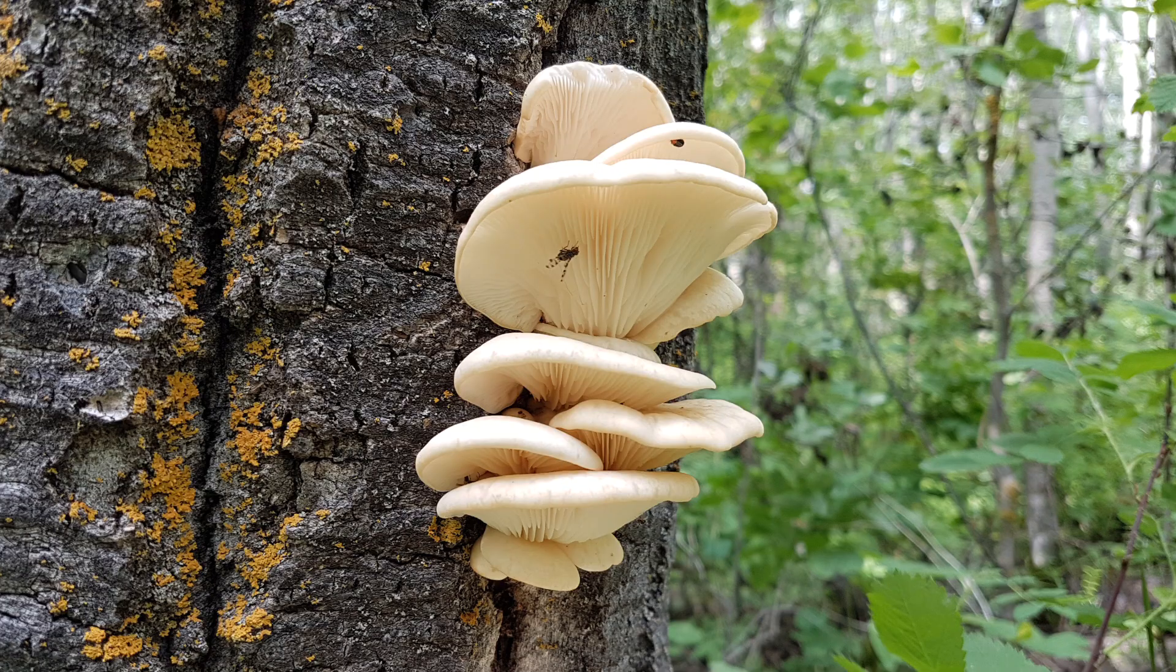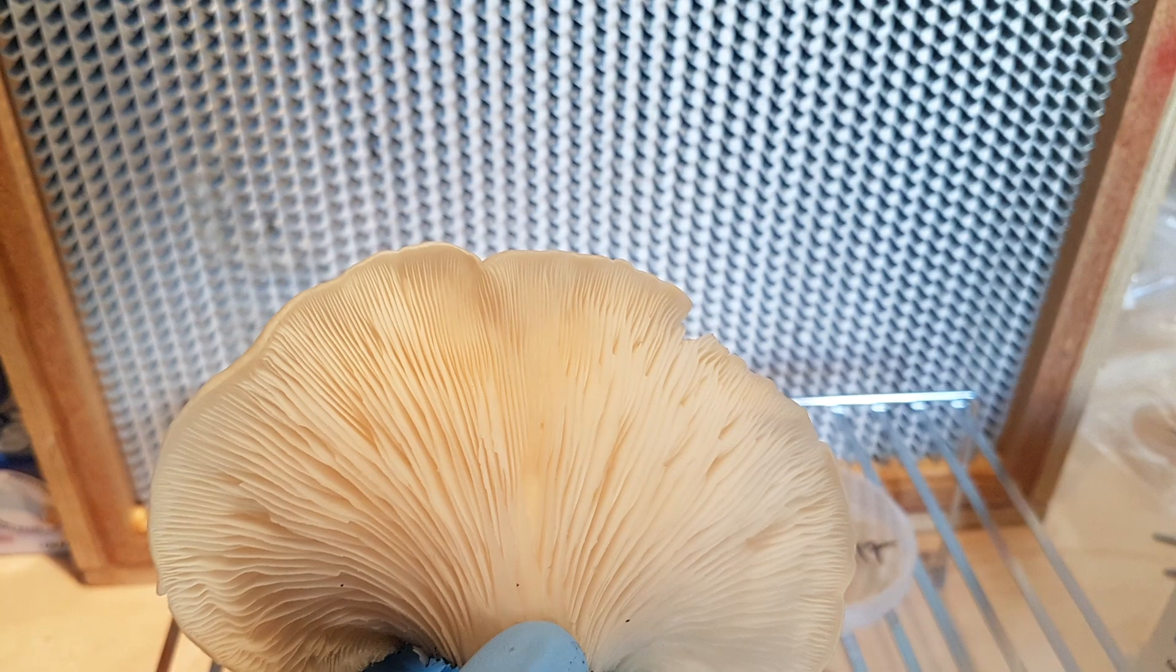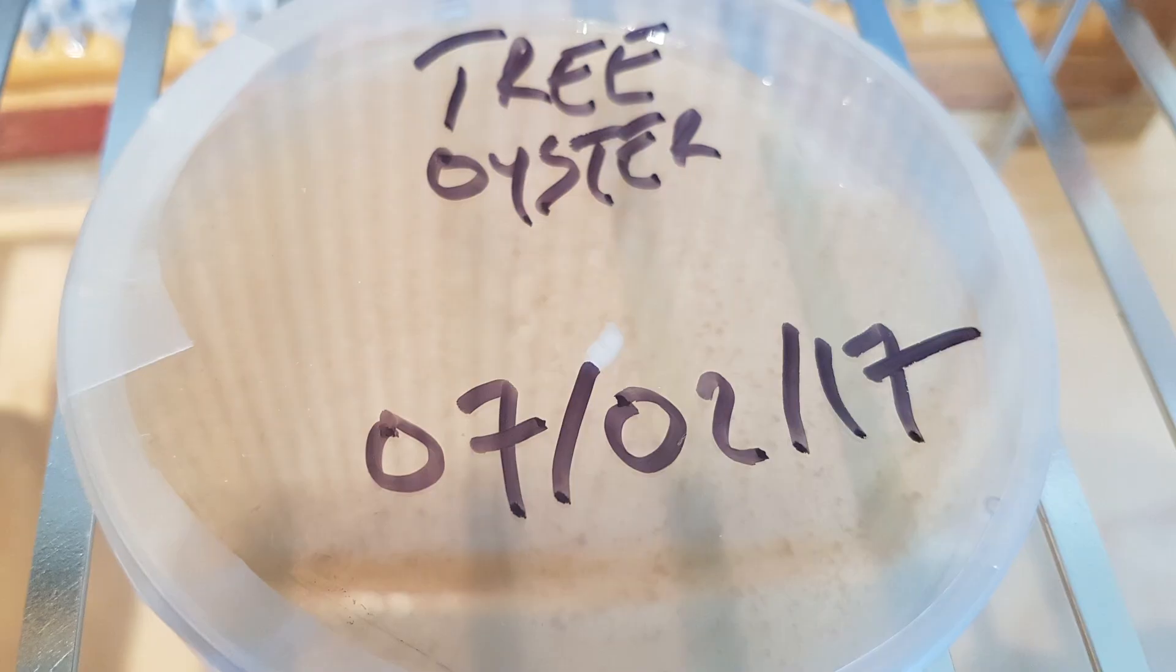Well first of all, the forest really is the original source for all commercial mushroom strains. Cloning allows us to take a wild mushroom, copy it in the lab, and eventually save a mushroom strain that we can use for commercial cultivation.